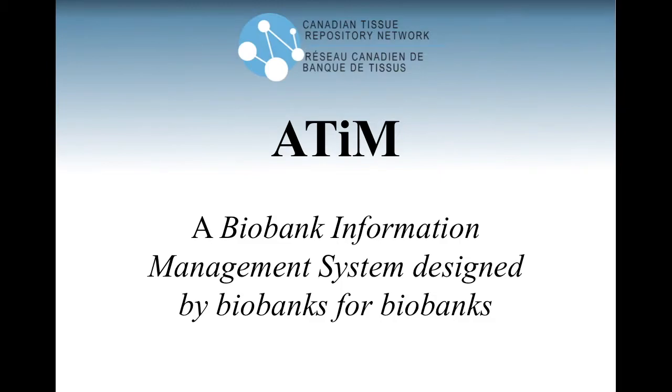Welcome to Atim, a powerful software tool for biobanking. Atim is a web application developed by ctrnet that holds a GNU General Public License. The development was open-sourced in collaboration with Biobanks for Biobanks. Originally built to support medium to large-scale oncological biobanking, it now supports a wide range of banks, such as childhood disease biobanks and research labs conducting their own biobanking.